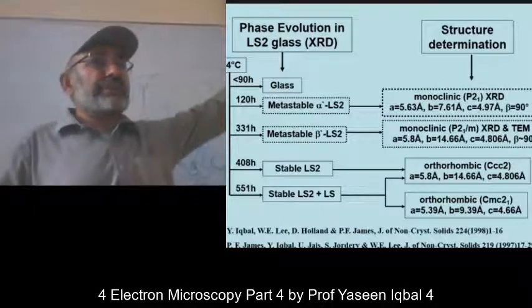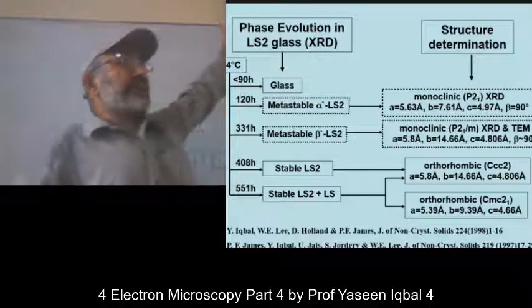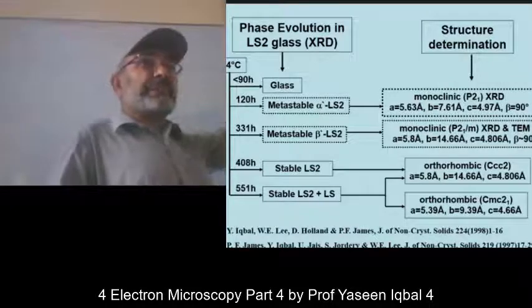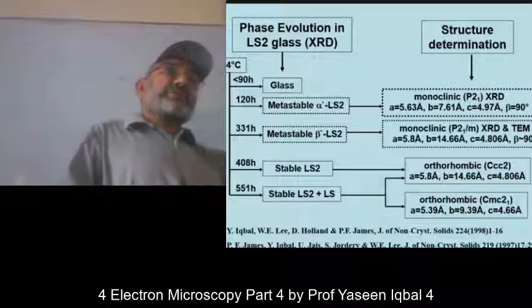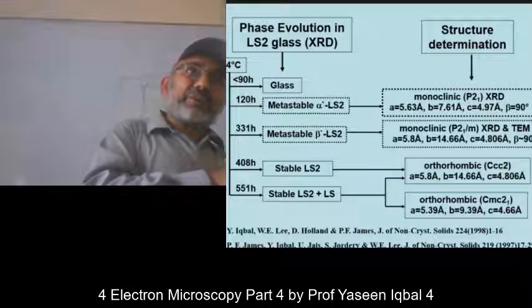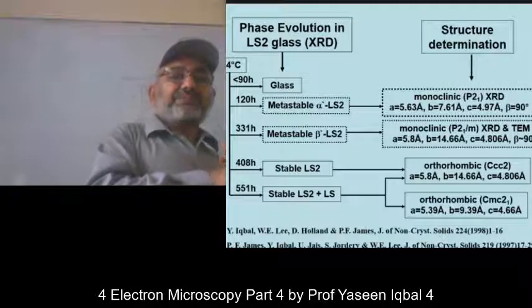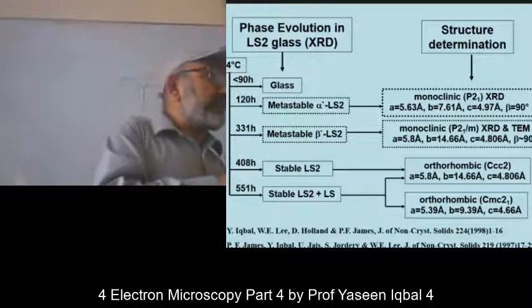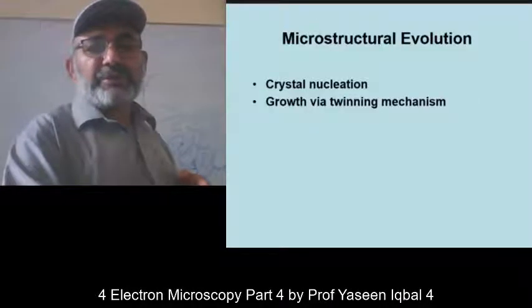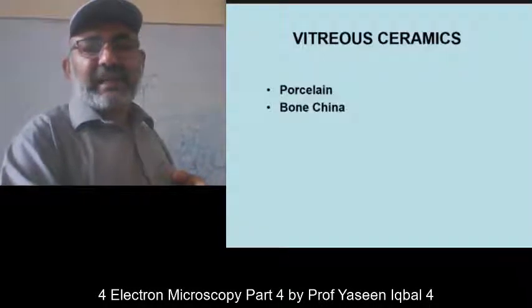This is a different composition. I am showing just as an example that I did XRD after different hours of treatment at a specific temperature or a different temperature. So you do XRD of the sample, then you do scanning electron microscopy of the sample, then you go to the individual crystals in the transmission electron microscopy, then finally the beauty which you see.